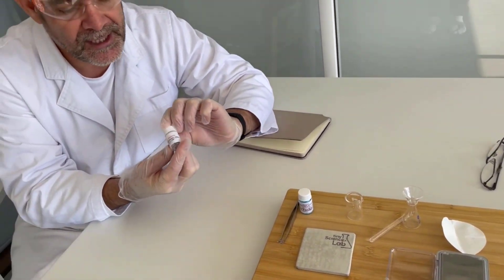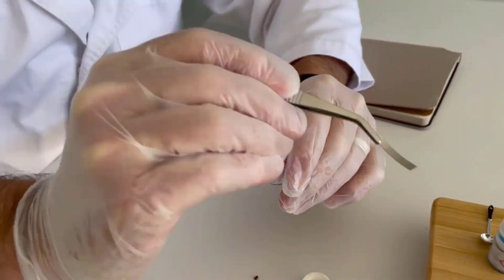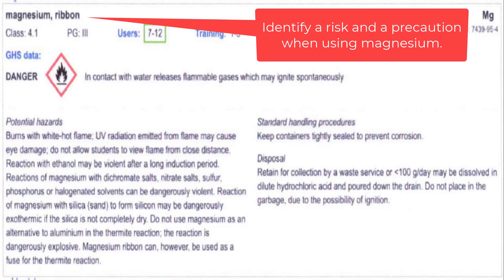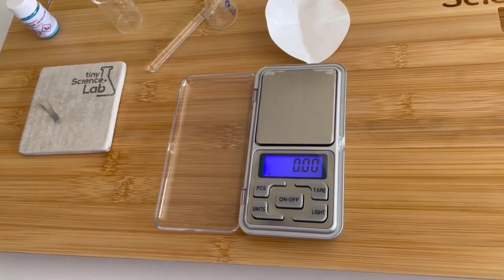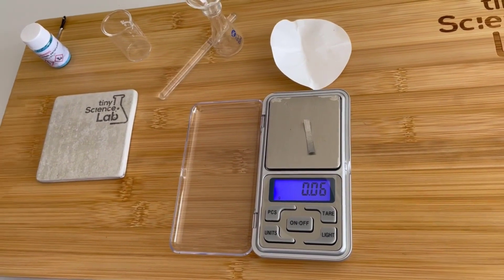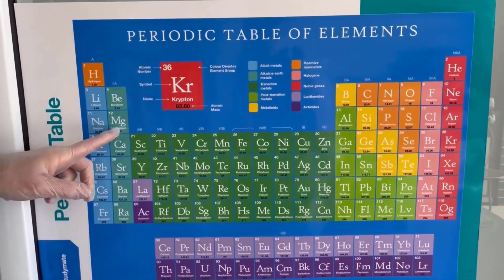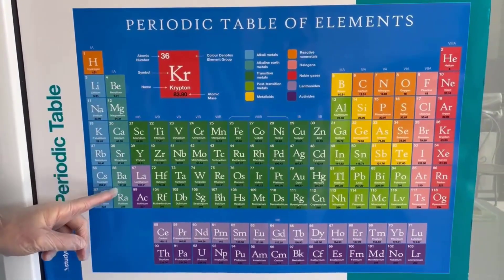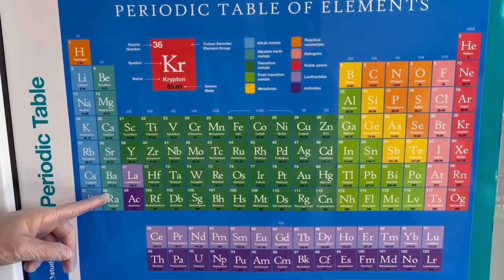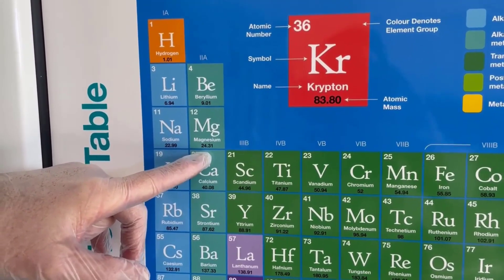The first component of this reaction is magnesium. There's a small amount of magnesium here. I'm going to take one of the strips out and weigh this — I'll make sure we tare it first. I've got a small strip of magnesium of 0.06 grams, so I'm going to write that down. In the periodic table, magnesium is here — it's in group two. Magnesium is an active metal, and that's one of the important things I need to be aware of for this reaction. The atomic mass of magnesium is 24.31.